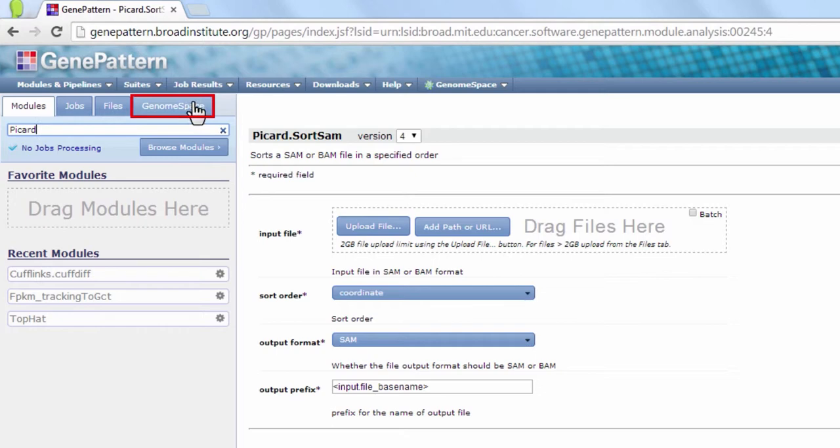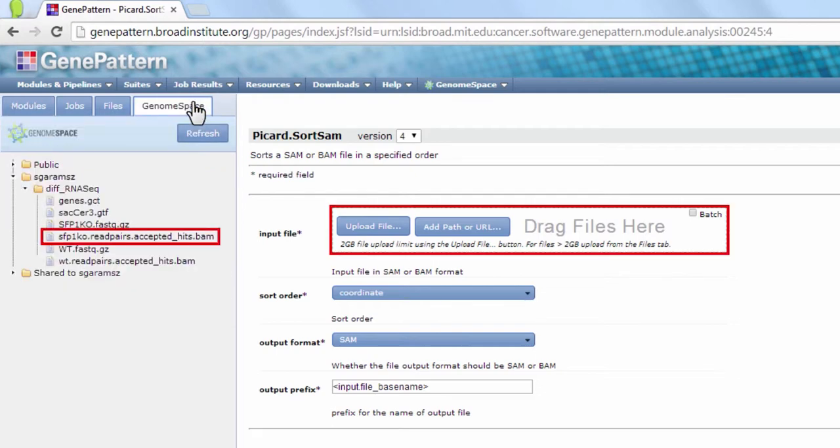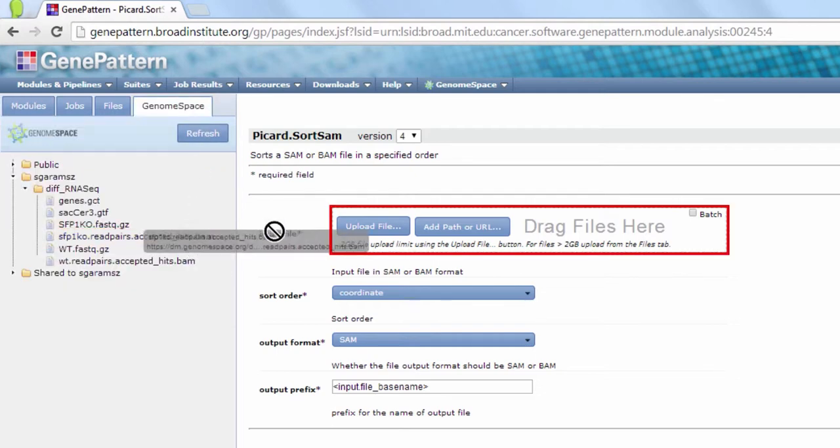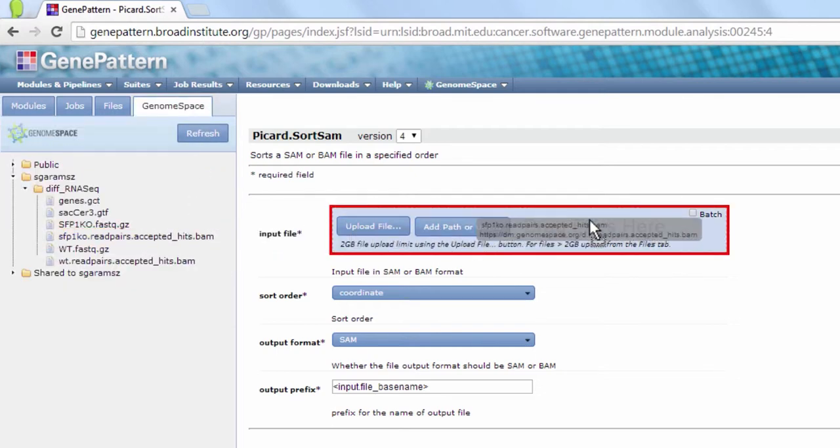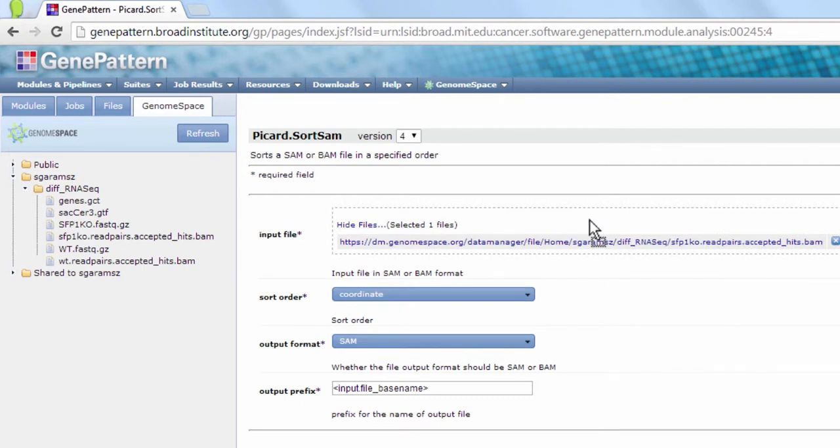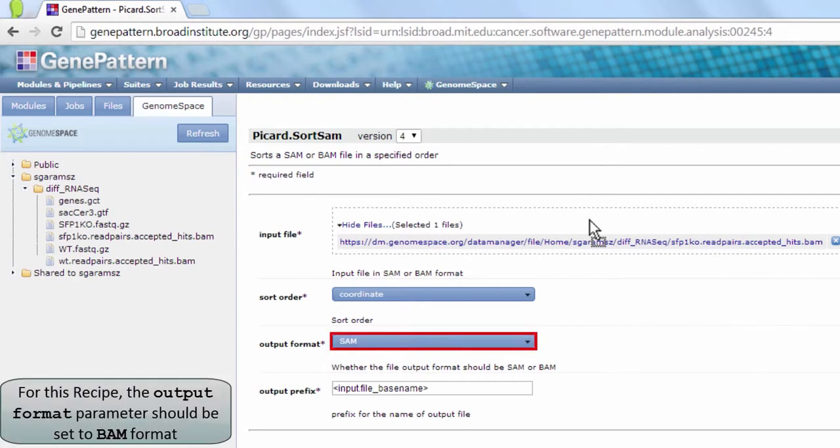Click the GenomeSpace tab and navigate to a desired BAM file. Click and drag the file to the Input File field. A BAM file is simply a binary compressed version of a SAM file.